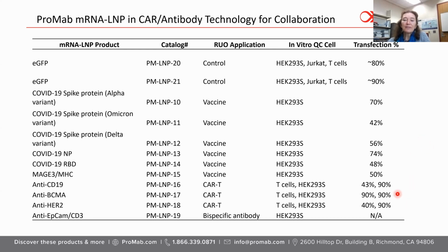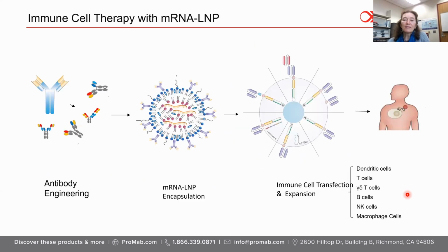And also I'm very curious about the previous slides, where you showed that you can incorporate some antibody on the surface of the nanoparticles. So let me see whether it's this slide. Is this modification a post-modification, or are you doing it just during the synthesis? Is it for a targeting purpose, incorporating the antibodies on the surface?